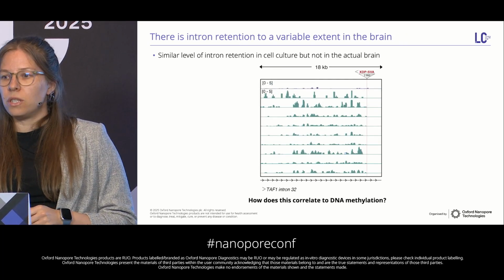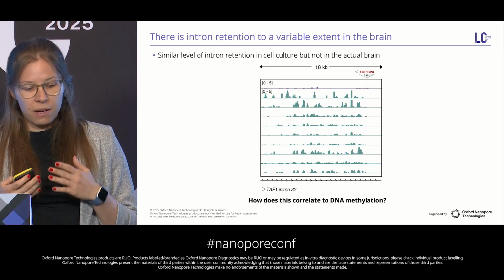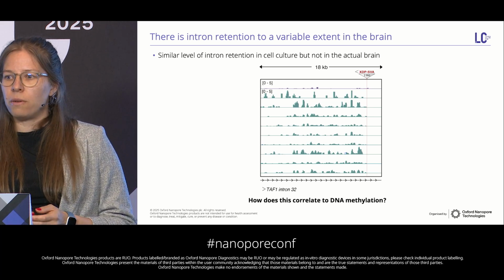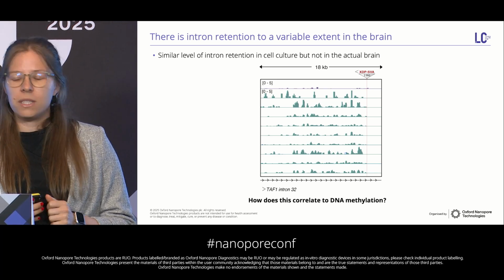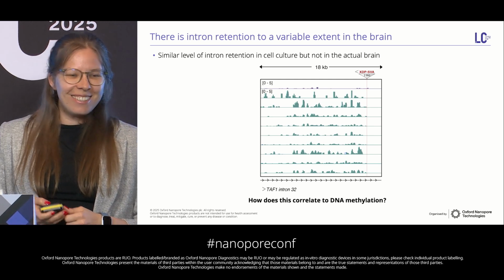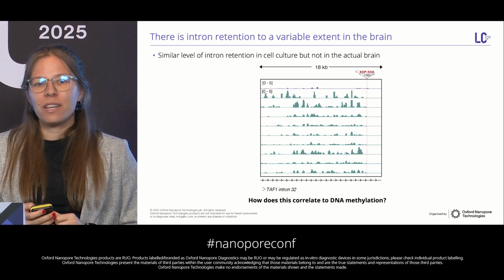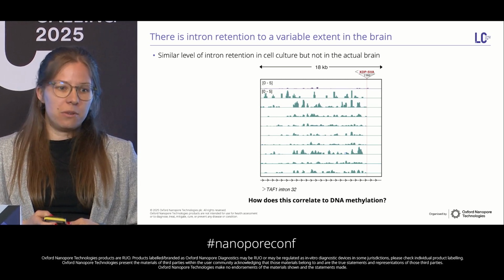And then next, of course, we wanted to see how the gene expression looks at this locus in the brain of the patients. And surprisingly, we found that there is intron retention, but the level of intron retention was very different in different individuals. So now if you remember the plot I showed you about the cell lines, there we saw the same level of intron retention, basically. But from this data, it looks like the picture in the human brain, as expected, is much more complicated than in a cell culture. So I think that's also a very important take-home message, that things are more complicated in the actual brain than in the dish. And now, of course, we are working on trying to find the correlation between the presence of DNA methylation and the level of TAF1 misregulation.